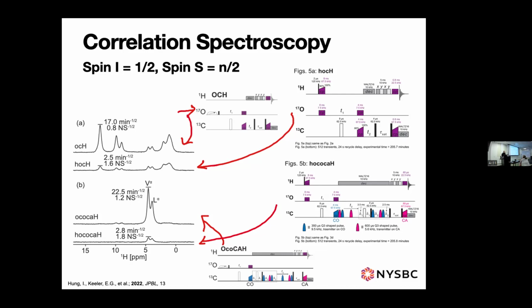So, it's a little bit off, but you're still good in both directions. So you do either of these. So now what can we do? Now we have really fancy experiments. They're starting to look like solution pulse sequence diagrams, with all of these different shaped pulses on the carbon channel here. This is getting a little ridiculous, with all kinds of pulses everywhere, selective and unselective.